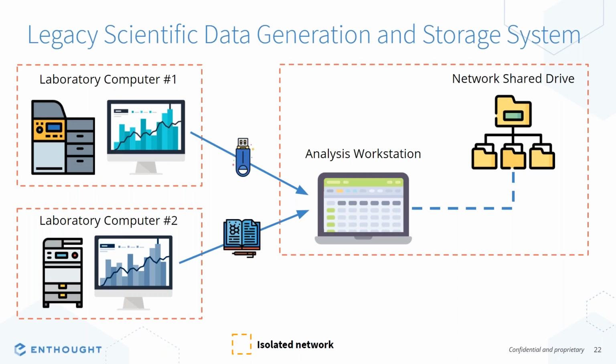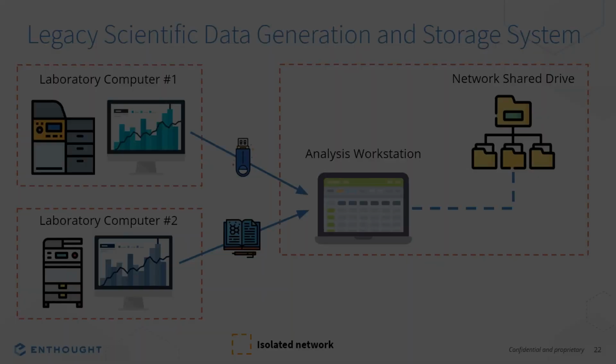And while these spreadsheets may be technically centralized and shared with other researchers, finding data of interest within a sea of spreadsheets, sifting through other files in project directories, is hard and it's slow. And this results in the reality that these files are very rarely referred back to for secondary analysis, or as information to help you design your next series of experiments for a new project that comes down the line a month, a year later.